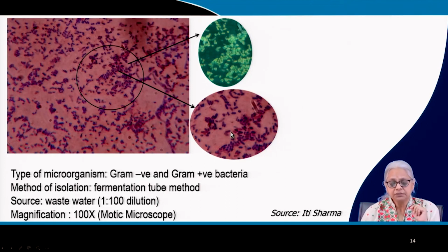So you can see the same image through the fluorescence option in the microscope will give you this kind of image, which is sometimes better. So if you have a software for enumerating the bacteria, it makes it easier to differentiate the color and therefore the images and enumerate the bacteria on that basis.